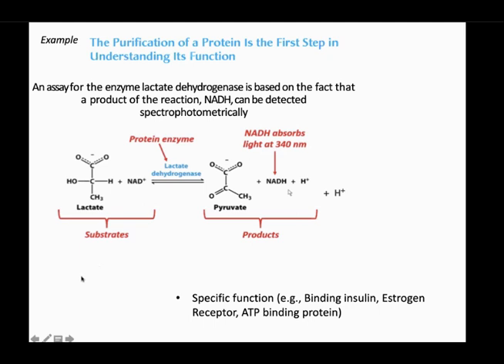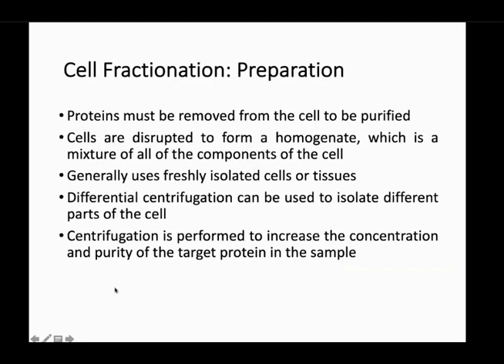So one of the first steps in purification is actually understanding the function of the protein that you're looking for, okay? As I mentioned, to purify the protein that you're looking for, you have to remove everything that you don't need, the cells, the tissue, etc.